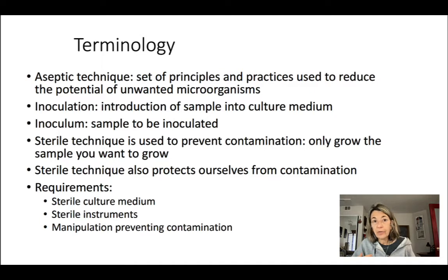Inoculation is the step of introducing the sample, and that sample is called the inoculum. So let's say you take a sample of urine or blood or saliva, etc., or a nasal swab from a patient. That's going to be your inoculum, and then you are going to introduce it in a culture medium.